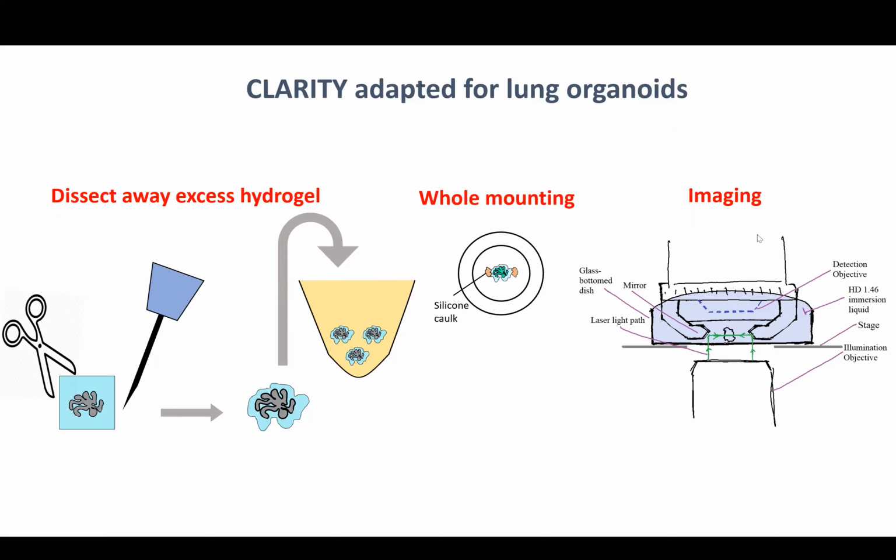The sample is mounted upright with silicone, so there's enough height for the mirror-generated light sheet to easily pass through the sample and for the instrument to be properly calibrated. The sheet of light is digital because the light source emits 2 points of light that hit the mirror. They move rapidly across the face of the mirror, creating the light sheet.